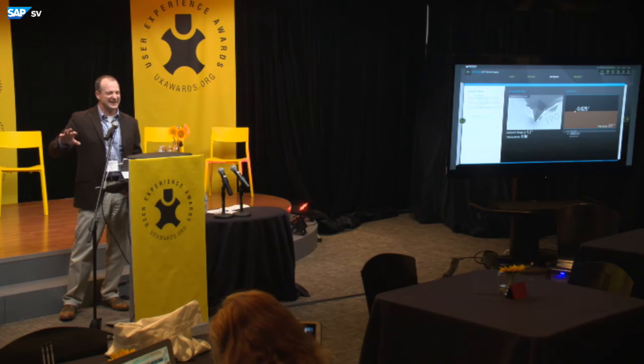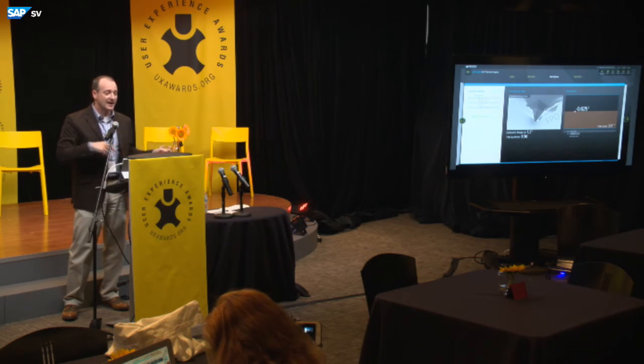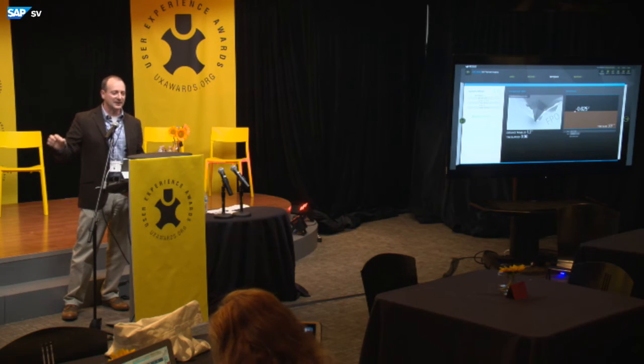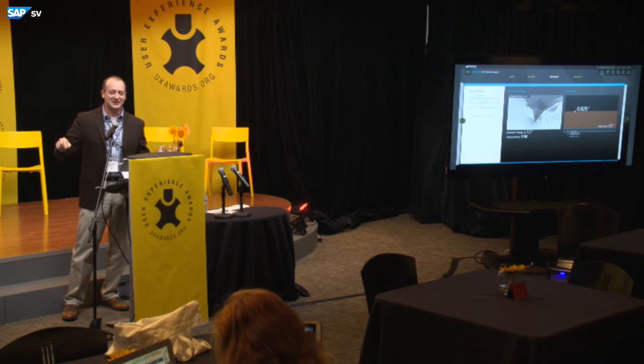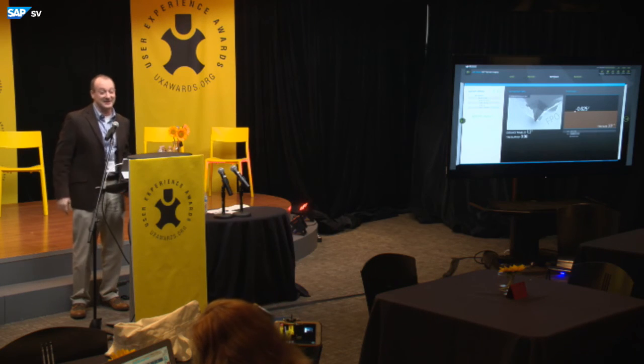And we did not initially have anything to do with that software, so it looked basically like the AFM software. And their customers for the electron microscope complained back to Keysight that their colleagues had much better software than they did, and when were they going to get the good stuff too? So we just finished a project to redesign the electron microscope software as well. So I'm counting that as a win.